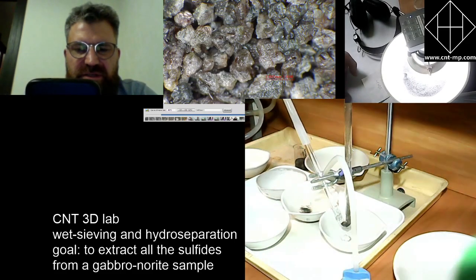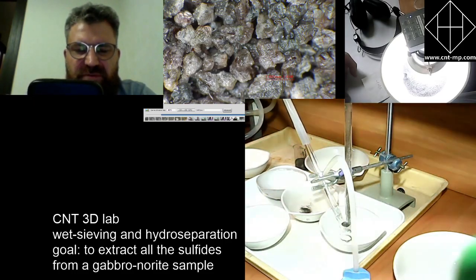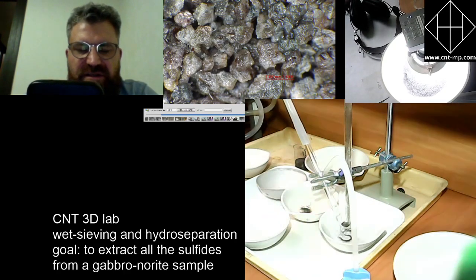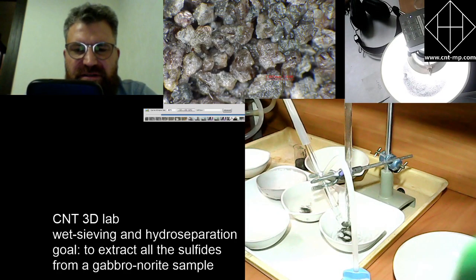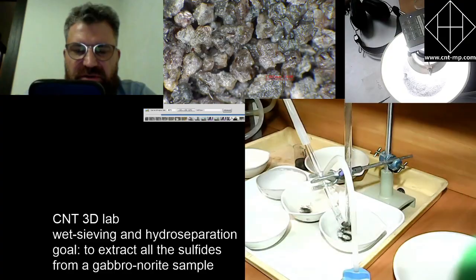So we switch the dish. Each time we change the regime, whenever we switch to another, the separation process is changing. Then you can program the device and it does it automatically. But before that, you really have to know how much time you need per regime, and make sure that it's working and you are not losing the grains of interest.